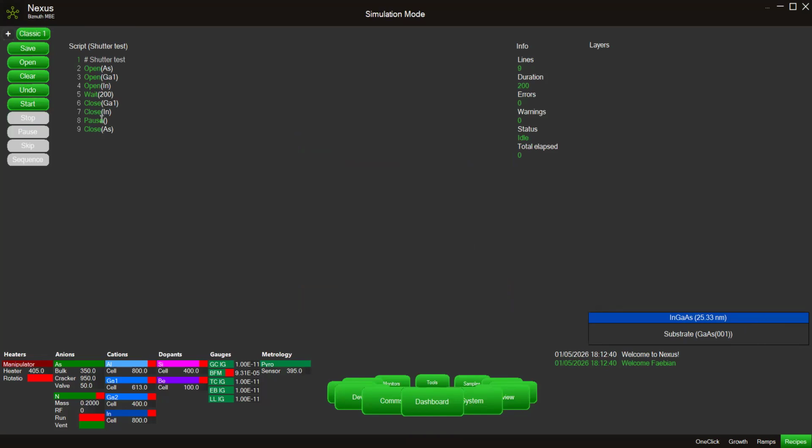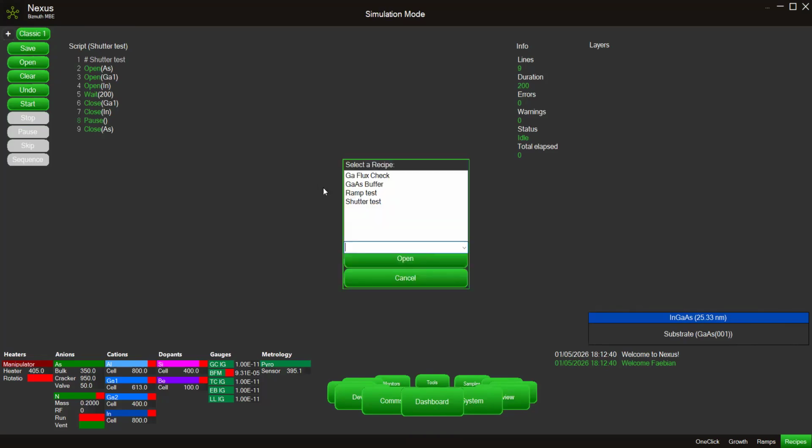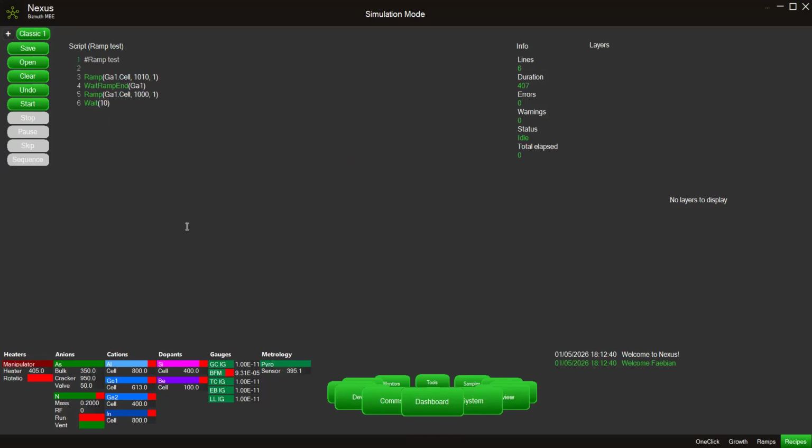Unlike wait, the pause command lets you specify an indefinite wait. The ramp and set commands allow you to set individual values. Ramp allows you to set a target temperature and a ramp rate. Rather than spending the time calculating how long the ramp will take to complete, you can pair ramp with wait ramp end to wait until the ramp is complete and then continue executing the next line.